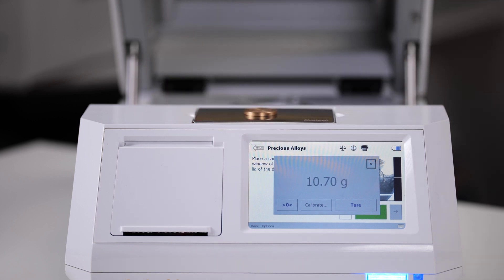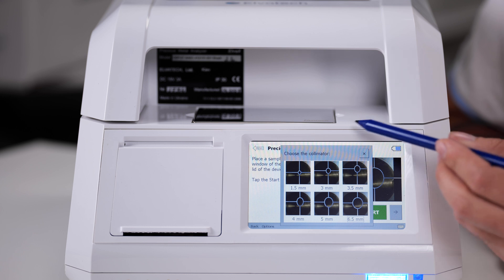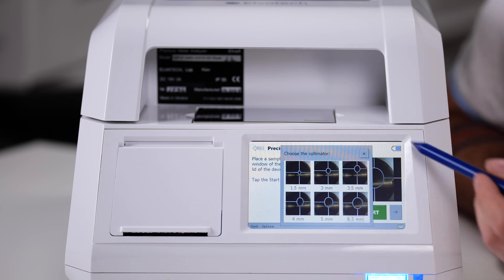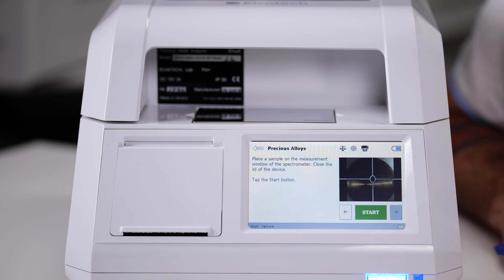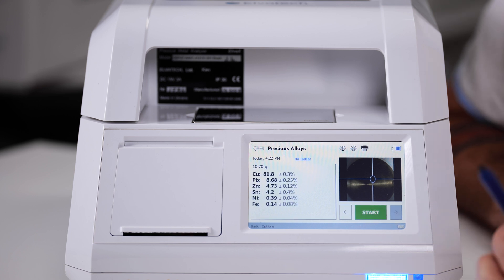As you can see, the weighing was quick and accurate. Before we move on to the analysis, I want to talk more about the collimators, as this information may be important for professionals who need flexibility in the size of the spot to be analyzed. We have six collimators with different diameters from 1.5 to 6.5 millimeters, which allows us to analyze different spot sizes. Thanks to the built-in camera, we can position the object correctly to select the analysis spot. After selecting the needed collimator, we just press the start button. The analysis takes just a few seconds, and here are the results — a complete analytical certificate that can be given to the client or saved for the archive.